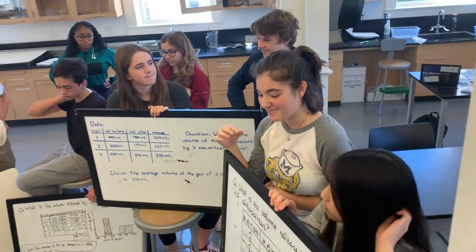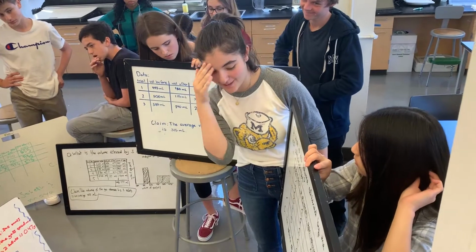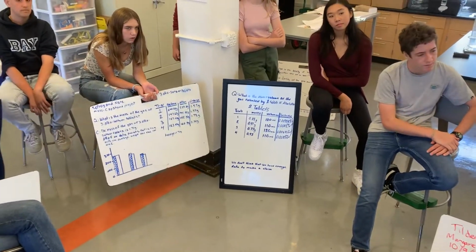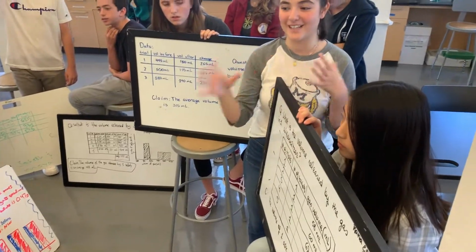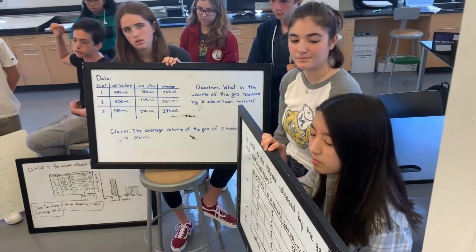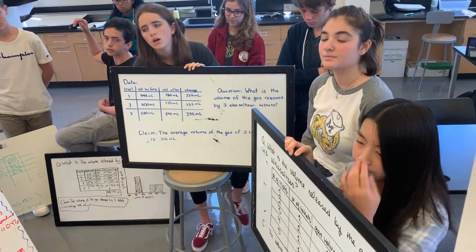Emily and I thought it was interesting that for our gas volume in milliliters, we got roughly 60, and on Alice and Maddie and Joe's board, they got 120, and we got one tablet and they got two tablets, so it kind of makes sense that our tablets have this volume. Yeah, because we didn't do the experiments together, so the odds that we made the exact same mistakes to get the same sort of proportions are lower.